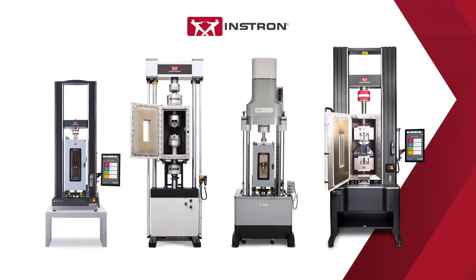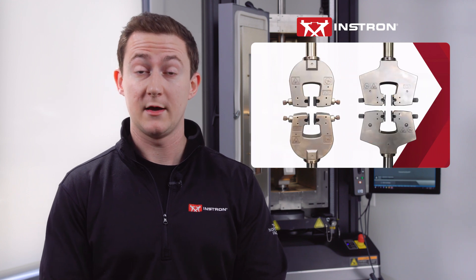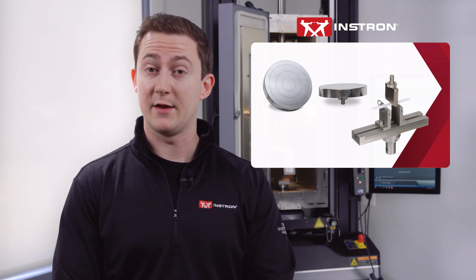Chambers come in a range of sizes to accommodate the space requirements of different static and dynamic testing applications. Instron offers a range of temperature rated mechanical, pneumatic, and hydraulic grips in various sizes and load capacities for testing all types of materials. We also have a number of temperature rated fixtures, including compression platens, bend fixtures, and many specialized composites testing fixtures.